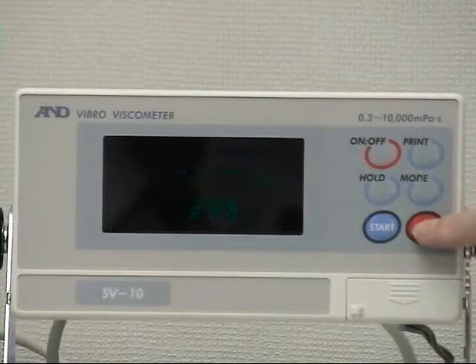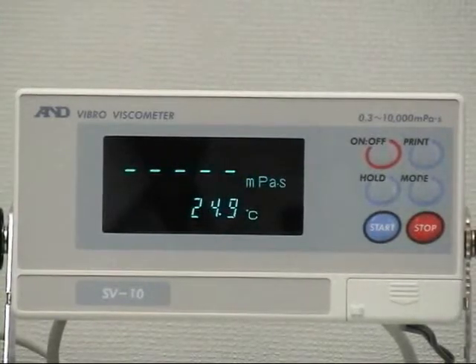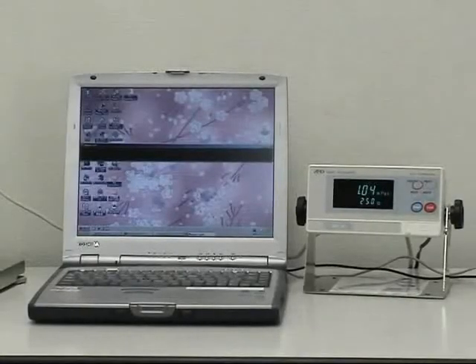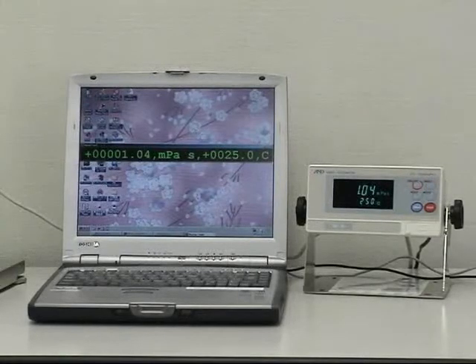Press the stop key again and the display goes into standby mode. Press the print key to send the measurement data, viscosity and temperature, via RS232C.